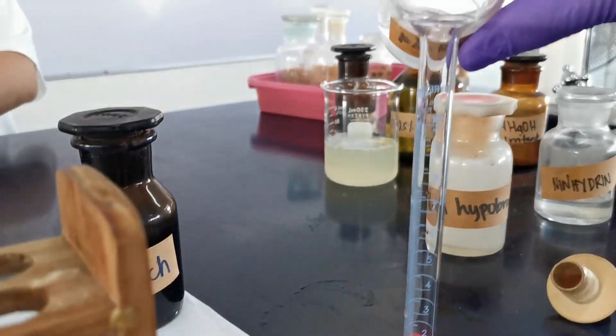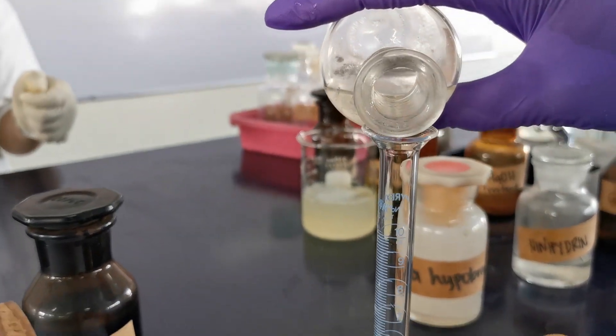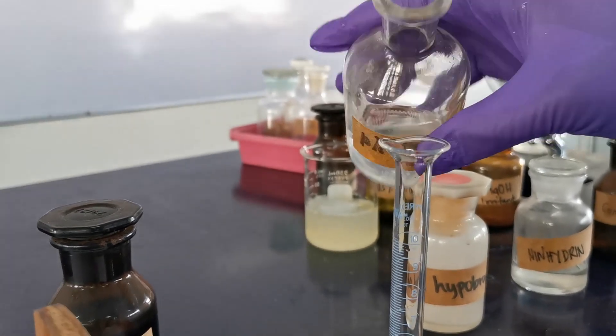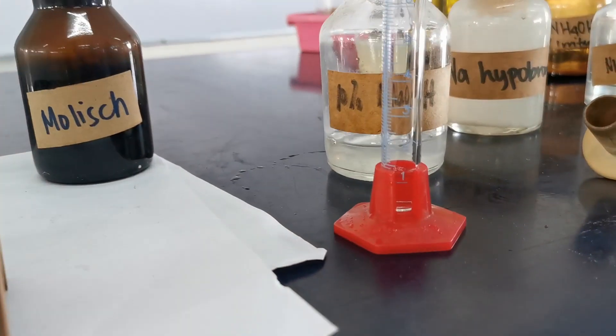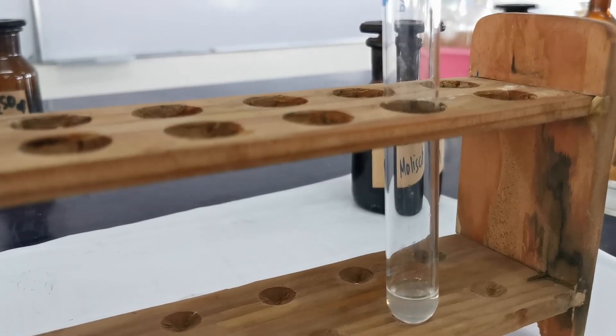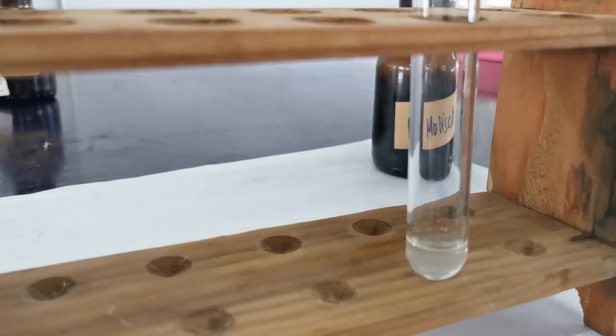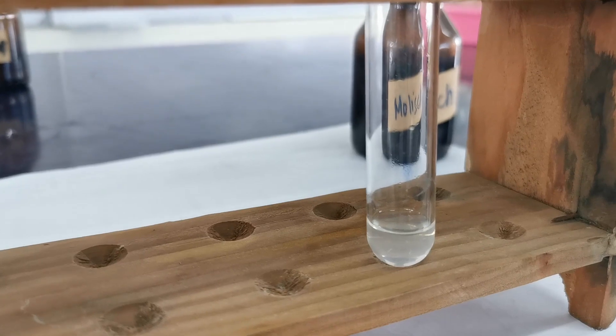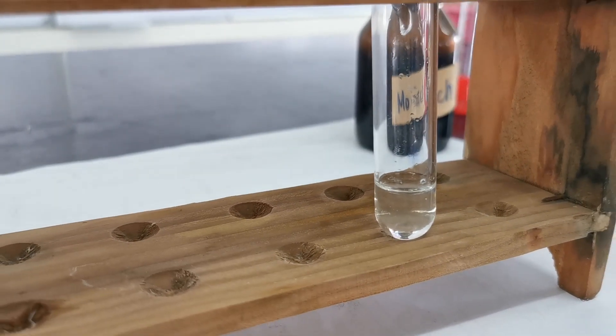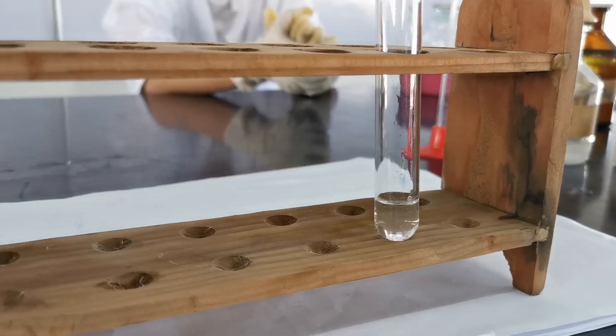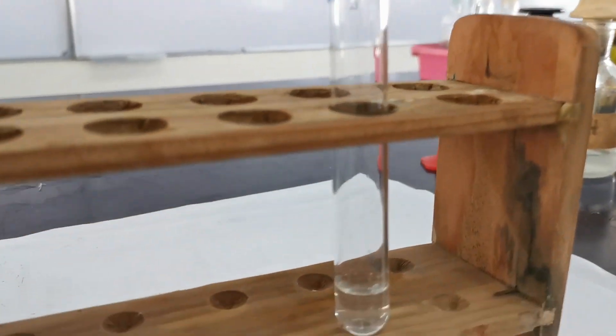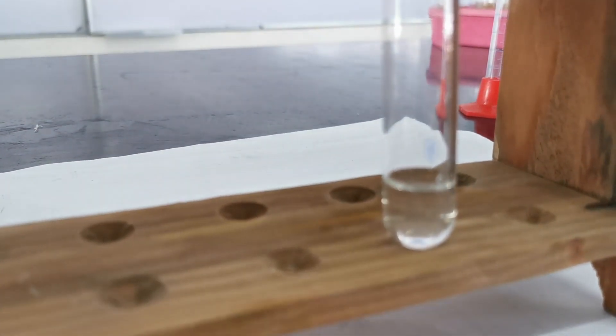Using a graduated cylinder, add 1 ml of 10% sodium hydroxide solution to 1 ml of egg albumin solution. Add 6 drops of dilute alcoholic naphthol solution or Molisch reagent.